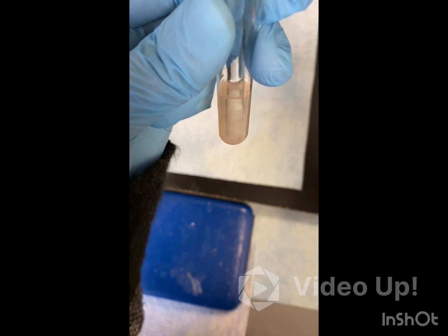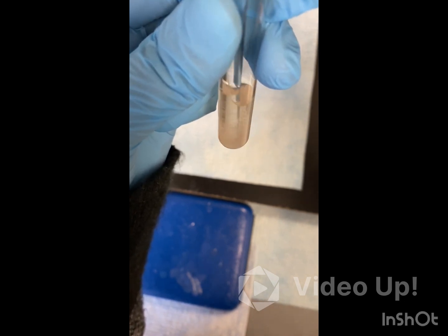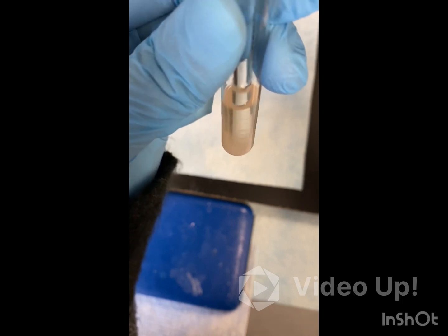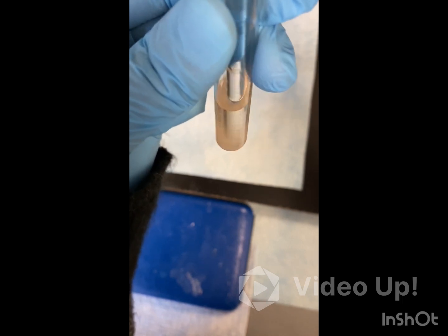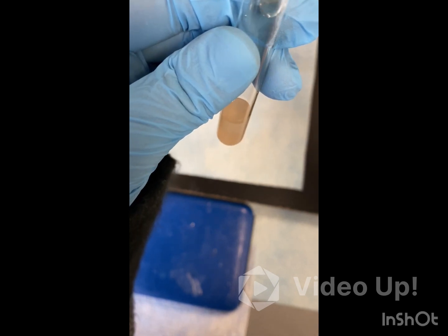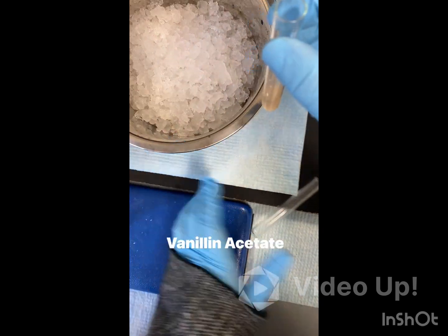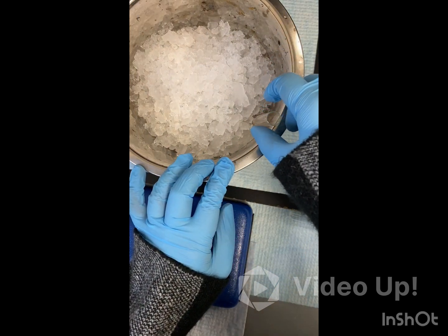Just mix it the best you can. After you mix it the best you can, you're going to put it in an ice water bath to cool it. Some vanillin may crash out, but that is okay. Once it's chilled, we're then going to spot it on a TLC plate. So now we're going to put it in our ice water bath and let it chill.